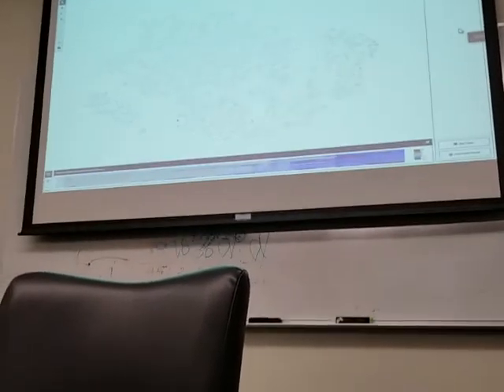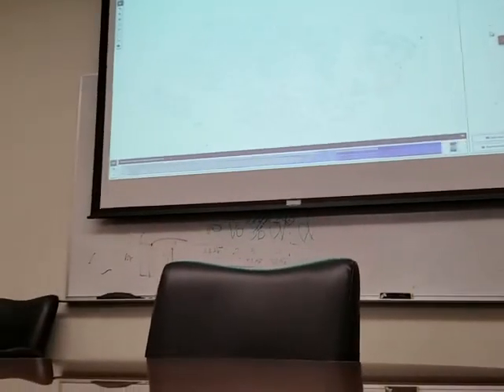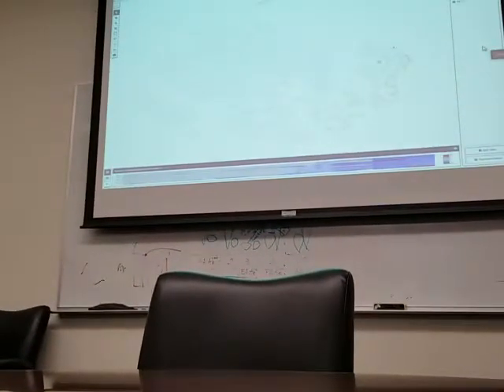So these are one treatment group and these are a different treatment group. But within those groups, they overlap quite well. If you take out all of these, the majority is up here, and if you just do these, the majority is down here.